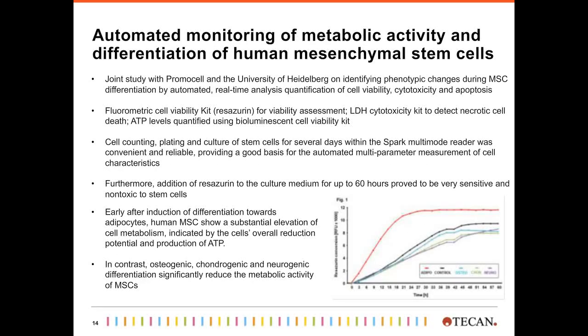The next study I want to review is very similar to the first one. It's again about measuring metabolic markers in cells over a long period of time. But in this case, we worked together with researchers of the University of Heidelberg and a company called Promocell, which provides assays very similar to those of Promega. And we investigated the differentiation of human mesenchymal stem cells.